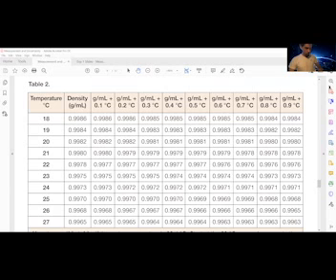That just means it needs to be flat, on a flat surface. It's on my desk. Okay, so put it flat down and then hit M for the mode until you get to G for grams. All right.